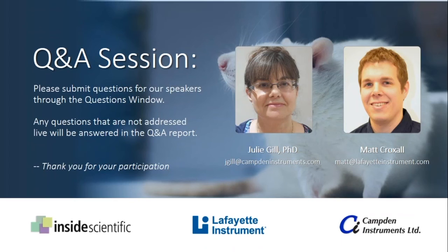Julie, I'll start by asking you this question from Yuichi at Harvard University. How do you compare the speed of training for your 5 CSRT task to the same task implemented in a traditional nose poke setup? And part 2, is nose poking the touch screen as intuitive to mice as the traditional nose poking?